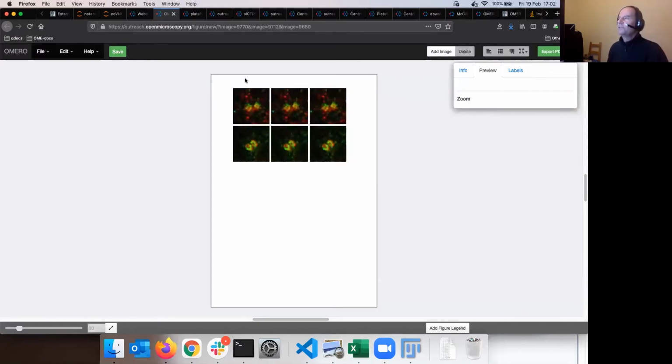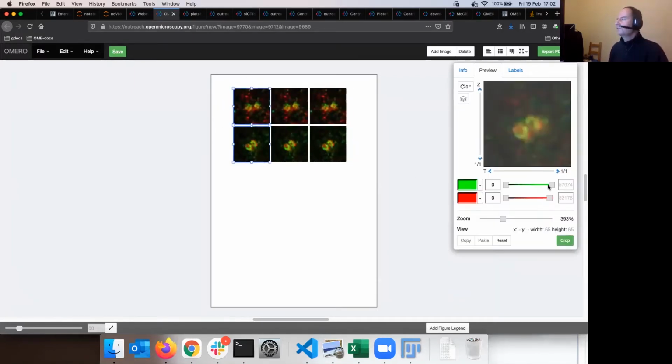And now let me adjust the rendering settings, which I can do inside the figure, as well as change the channel display, such as here in the first row green, in the second row red. And I showed you actually this is coming to the kind of split view. This is the same trick like in iViewer. I'm done with the channels, and the third one, of course, will be the merge.